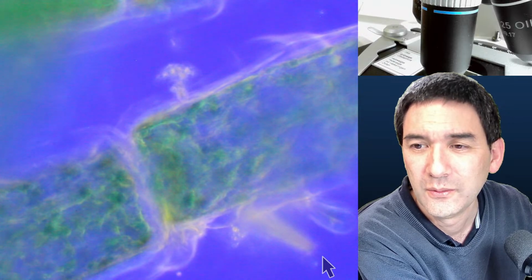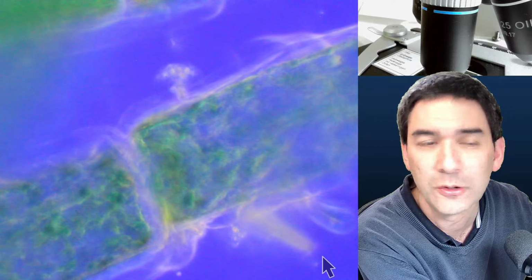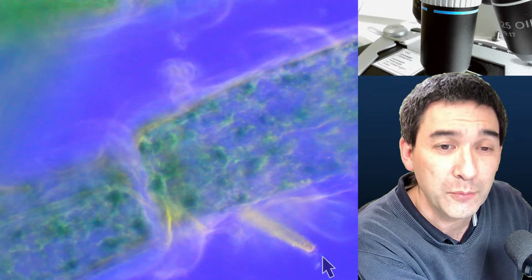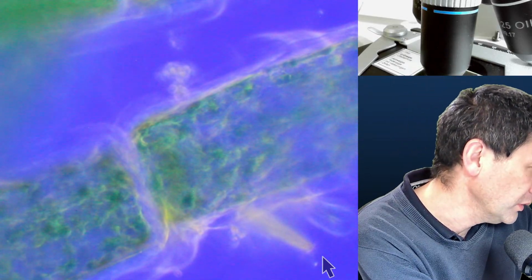What medium was the algae mounted in? Impressive that it hasn't lost color. Unfortunately, it doesn't say which mounting medium was used, but I'm quite sure. Well, actually, I'm not even so sure anymore.